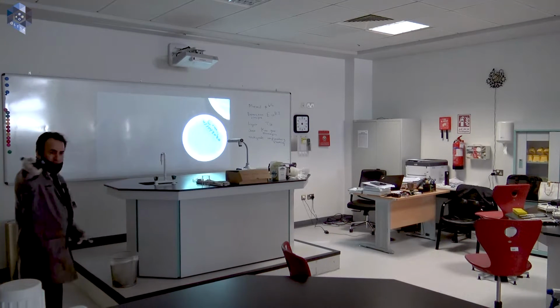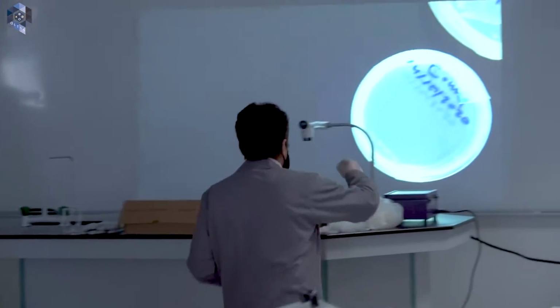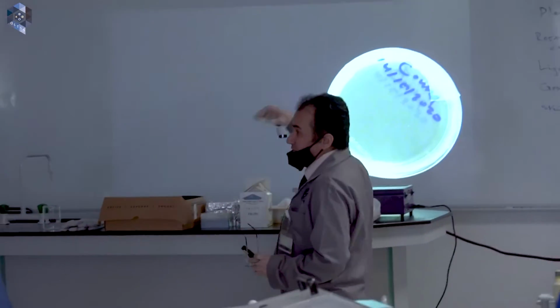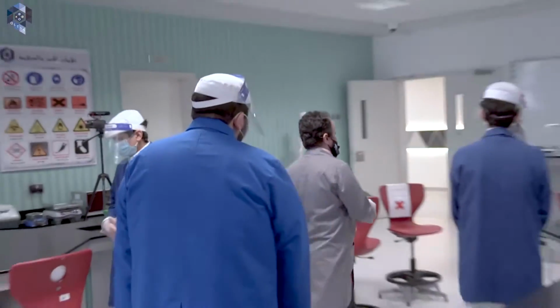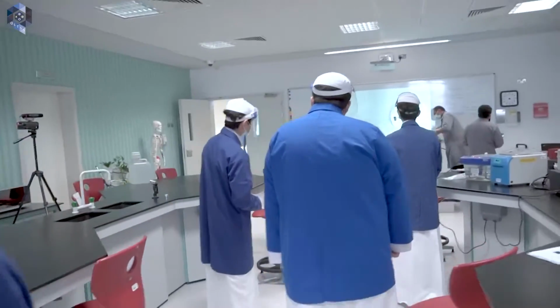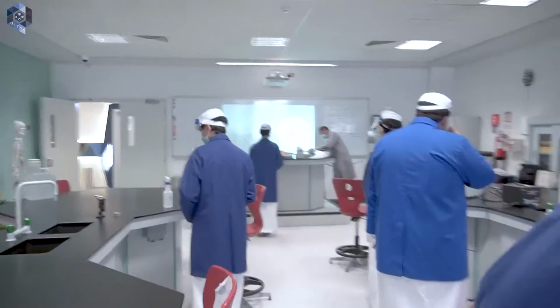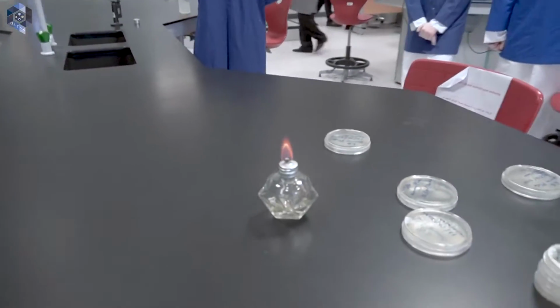Okay. Now we will resume with this. We will transform the bacteria. We'll start transforming the bacteria. We need to check the procedure again. Now, bring the toothpicks and the loops for the transformation.